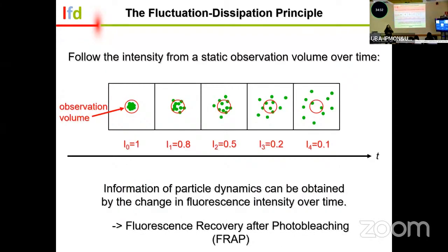All right, so imagine that we take some beads and we collect the beads and we hold them, right? So this is what you're seeing in the center. And Fick's law and the diffusion principle states that as a function of time, if you let go, these particles will move away from the center. So if we're observing them at time 0, we see that the molecules are in the center, and as time progresses, those molecules will move away from the center.